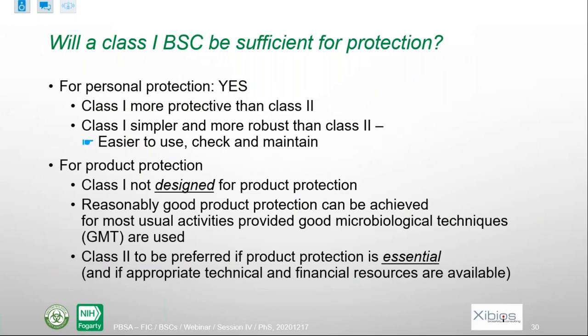फिर एक सवाल था कि क्लास वन बायोसेफ्टी कैबिनेट जो है, क्या ये हम यूज़ कर सकते हैं, ये प्रोटेक्टेड है?